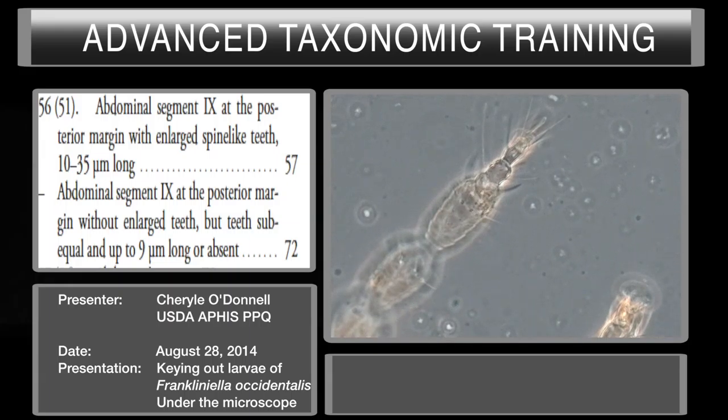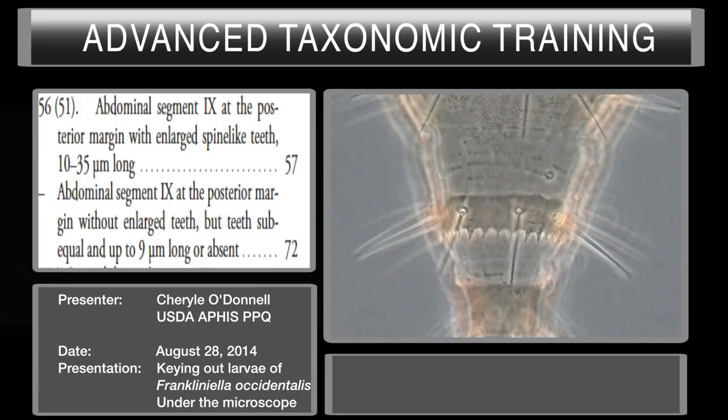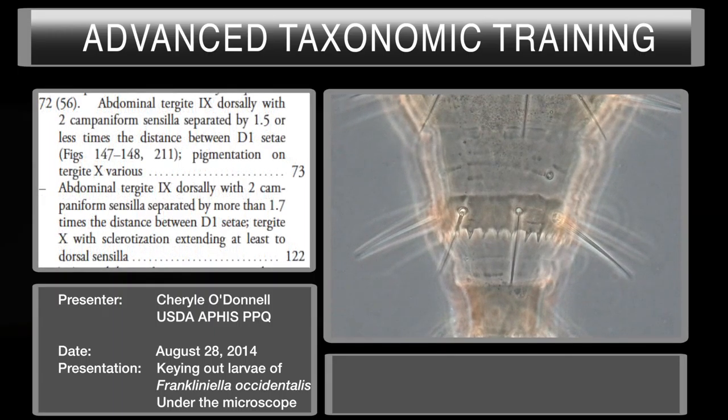Couplet 56 asks if abdominal segment 9 at the posterior margin has enlarged spine-like teeth. Looking at that segment — these are not spine-like, they are triangular shaped. So we fit the second part of this couplet: abdominal segment 9 at the posterior margin without enlarged spine-like teeth, but teeth sub-equal and up to 9 microns long or absent. This takes us to couplet 72 on page 133.